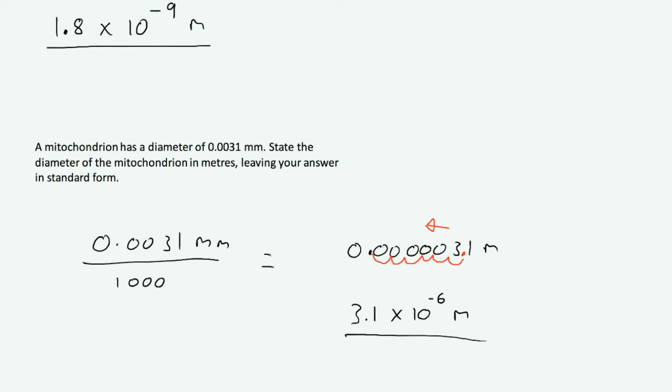And a slide is basically a flat piece of glass that is going to be put onto your microscope, and on top of it, that's where you're going to have the cells that you're going to be looking at. Right, so we need to prepare our slide. All right, so how do we do that?